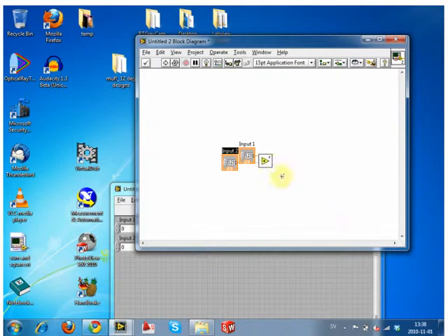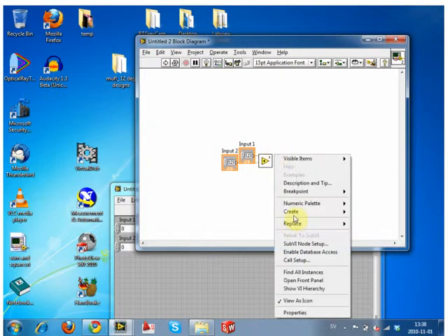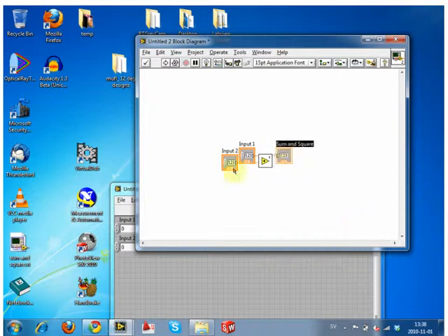right click, create indicator. And you should notice they're all named the same as what we named in the sub VI. So it's pulling the names of these things over, because we're trying to keep them as similar as possible. And again, we hit cleanup because it looks pretty.